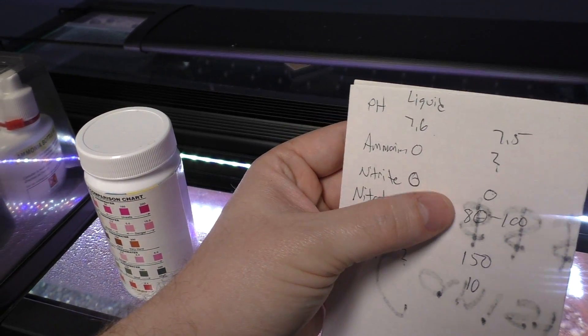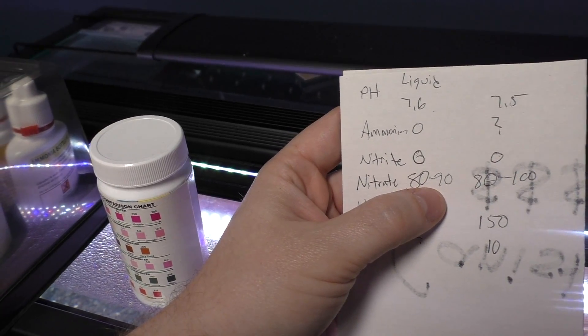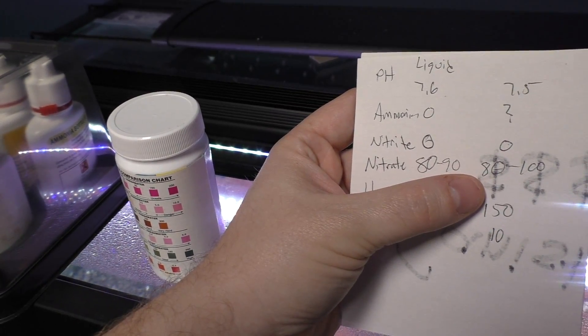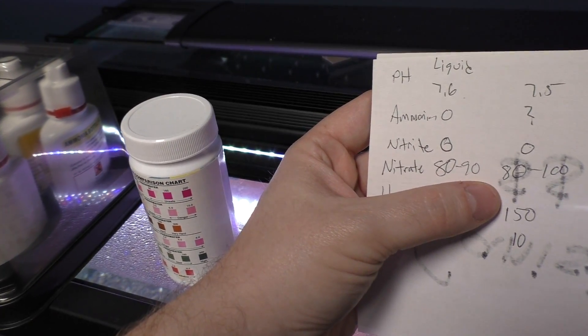Nitrite was both zero, so they both matched on that one. When it comes to nitrate, the liquid kit was 80 or 90 for sure, and the strip kit was 80 to 100. So I'd say they were fairly similar readings in my opinion.